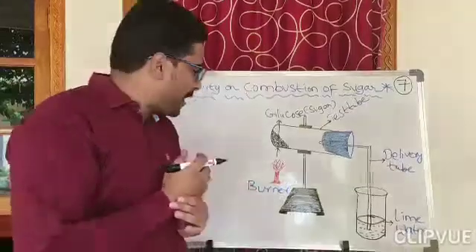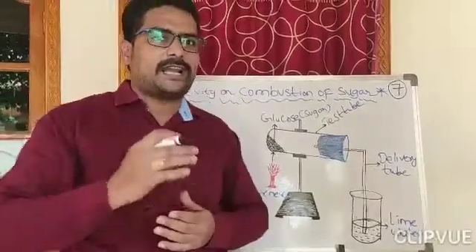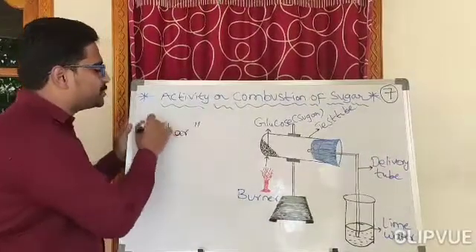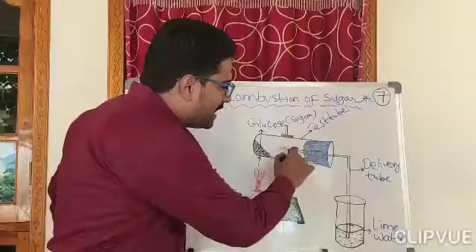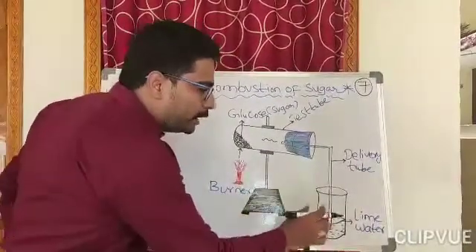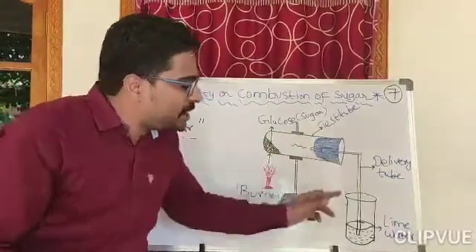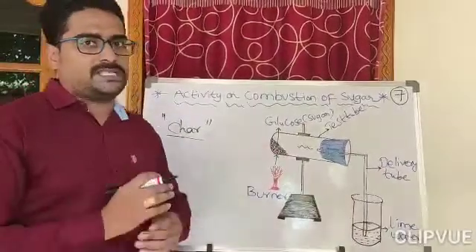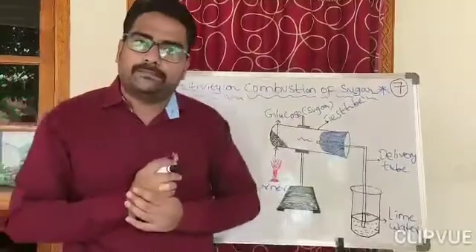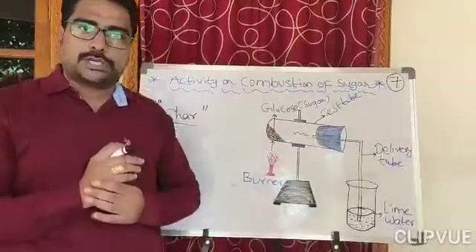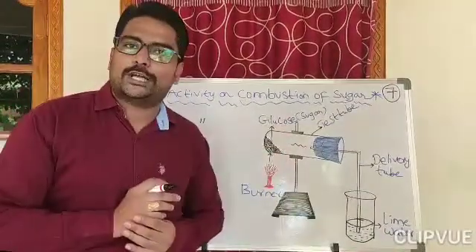We heat the glucose or sugar solution and observe what changes happen. When we burn glucose or sugar, it starts to char — it becomes blackened. Then it starts to give flames. After some time, a gas is released from the test tube, which enters into the lime water, and the lime water turns milky white. In the process of combustion, carbon dioxide gas is released, which turns the lime water milky white. Heat energy is also released, and water is also produced.